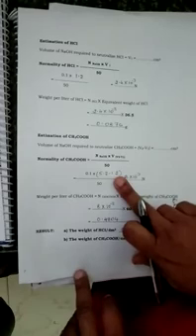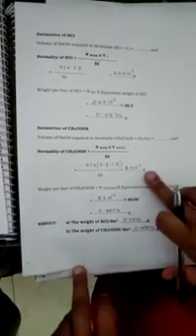Then you express it in terms of weight, in grams. It is obtained by multiplying by the equivalent weight. So this is for hydrochloric acid, and you calculate for CH3COOH, or acetic acid, separately. Here the formula is N of NaOH into V, where V is V2 minus V1. V2 minus V1 gives the volume of sodium hydroxide required to neutralize your acetic acid. So you get the normality first, multiply it by the equivalent weight, and you get the weight of acetic acid. In this way, you can calculate both the weight of hydrochloric acid and acetic acid using the conductometer.